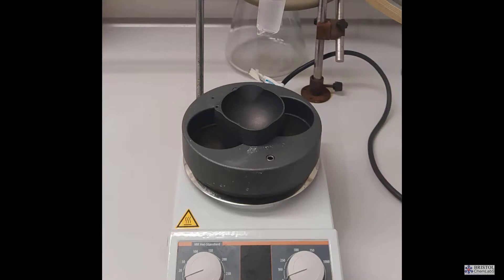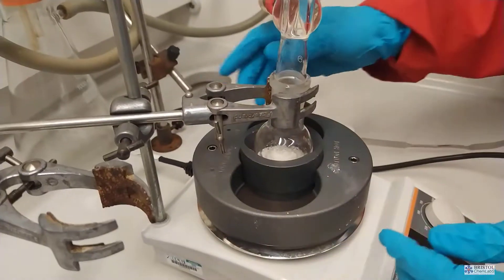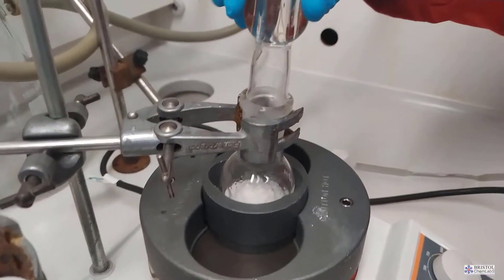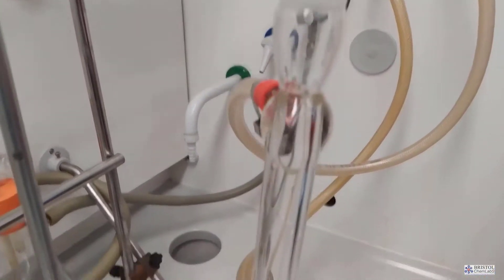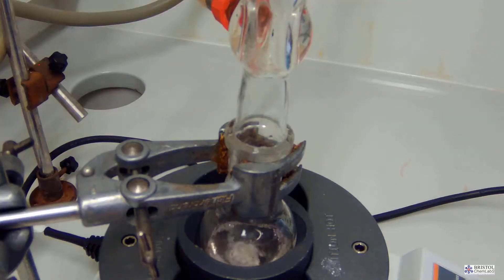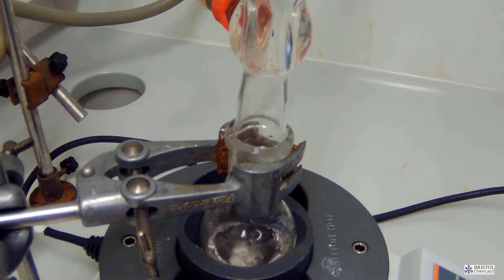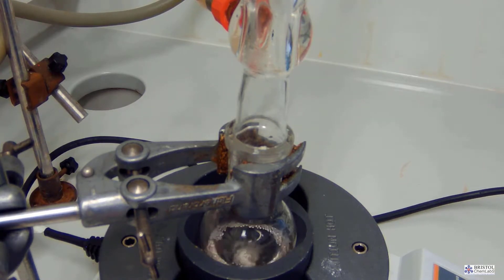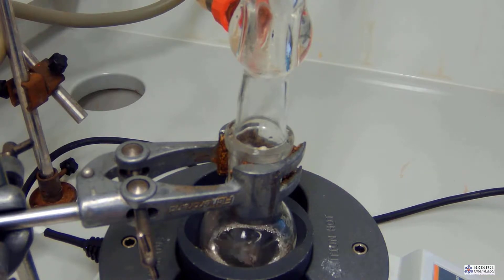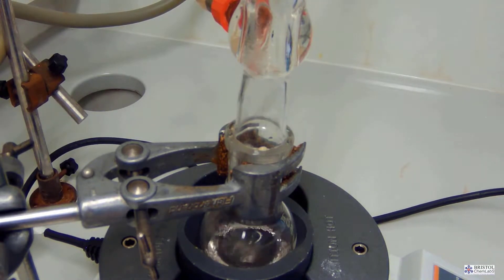You should note that many diagrams for reflux in textbooks tend to be wrong. There should only be one clamp engaged in the apparatus and that secures the neck of the reaction vessel. The condenser merely sits into the top of the reaction vessel and this makes it easier to remove once the reaction is complete. You've only got one clamp to move to remove the reaction vessel from the heating mantle.